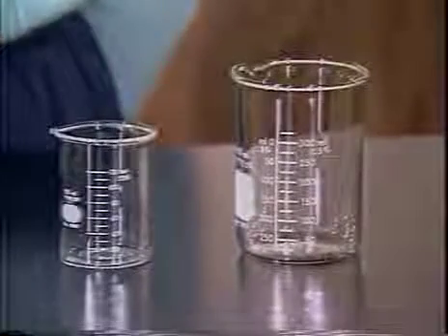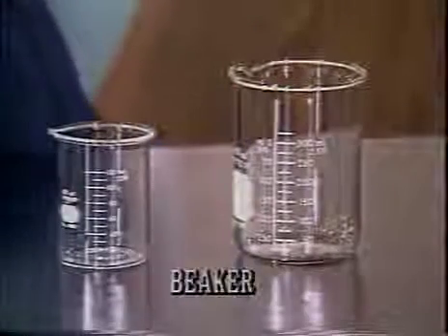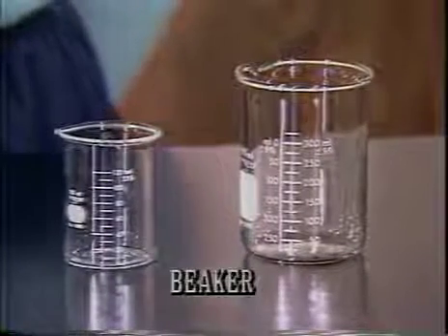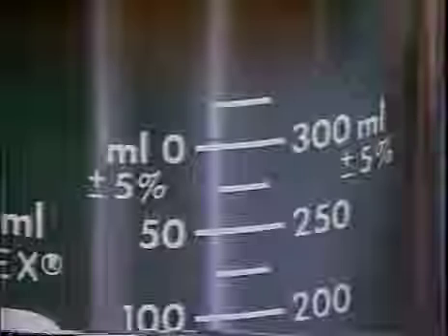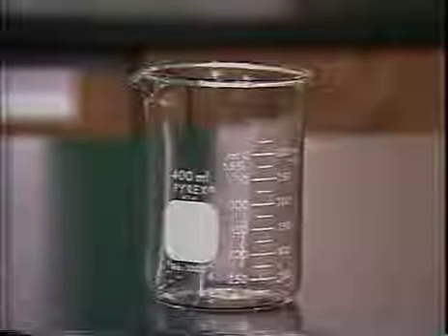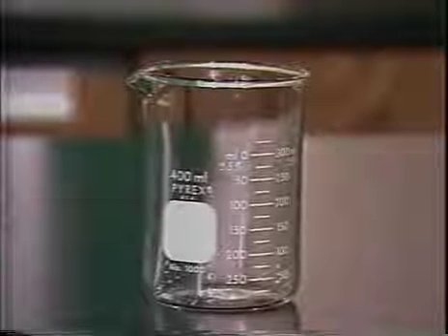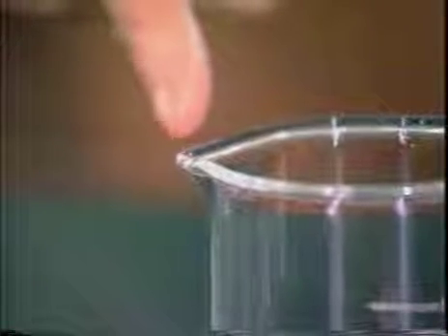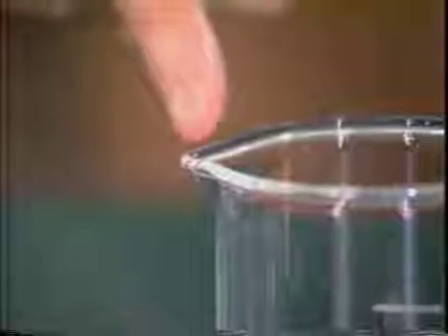Most of the glassware we use in the chemistry laboratory has volumetric gradations on it. For example, these beakers show the volume in milliliters. Beakers, as you remember, are used to contain or to pour liquids, and for this reason they have spouts.